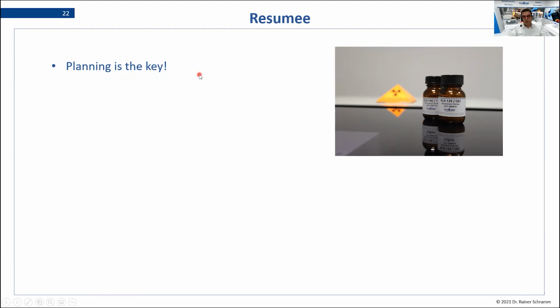Also, what we learned is that the method you should use and how you should do the measurements must be described as best as possible, so that every participant really knows what to do and that we have a high quality of results in the end. There are always new materials around.